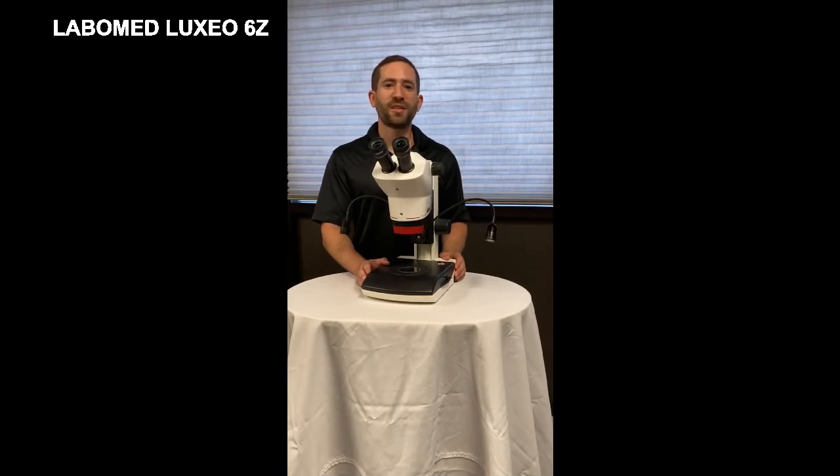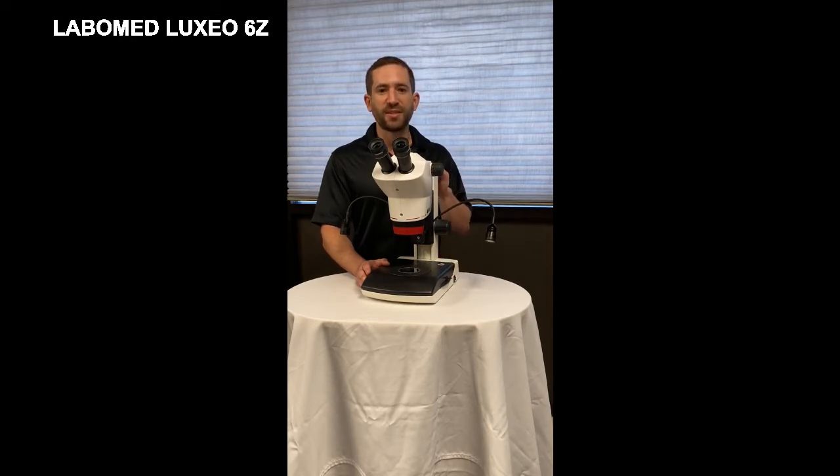The Labamed Luxio 6Z is a versatile high-quality stereo microscope available on numerous stands. This is the LED stand.